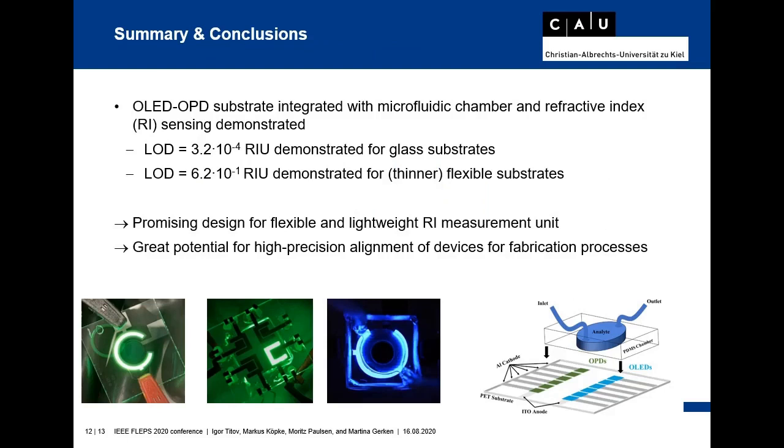Now I would like to give a short summary and a small conclusion of my talk. The presented research demonstrates that the integration of a flexible OLED-OPD unit with 6 OLED-OPD pairs and a flexible PDMS microfluidic chamber can be used as a measurement system for refractive index determination of fluids. We conducted this proof of concept by subsequent filling of the chamber to achieve refractive index change. We obtained a limit of detection of 3.2 times 10 to the power of -4 refractive index units for glass substrates and an LOD of 6.2 times 10 to the power of -1 for thin flexible substrates.